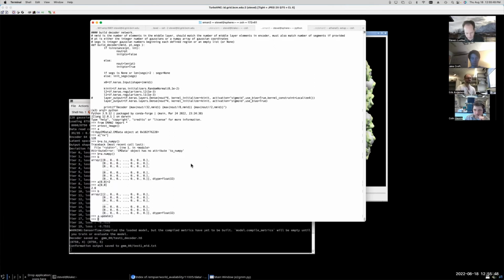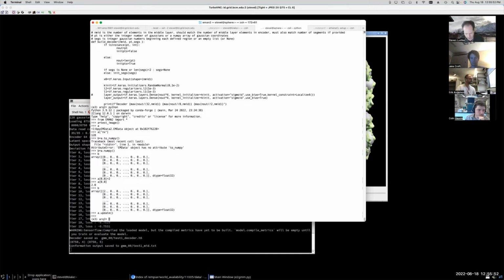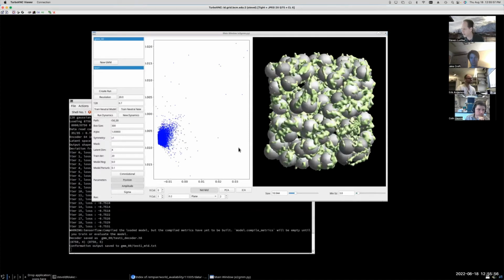Okay, that finished running, so maybe we'll switch back to talking about that again, and then we can get more into some of the technical details in that next week, since we're running at an hour now.